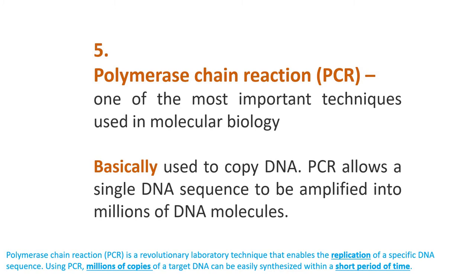Because الفكرة أنه sometimes we find a very very tiny undetectable sometimes sequence of DNA. Like if we do the PCR, we can copy this sequence many times by PCR technique, وبالتالي يصير عندي measurable or valuable amount of DNA copies أقدر أسوي بها further investigation and technique.